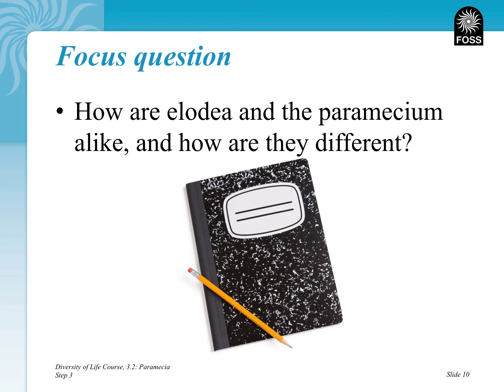The Elodea cells, they're all stuck together, trapped in there to make up that Elodea leaf. Whereas Paramecium, they're on their own. They're individually separated, and they are independent. The Elodea cells are part of a bigger organism. You take all of those Elodea cells and bricks to make the Elodea leaf, whereas the Paramecium is alone and on its own.